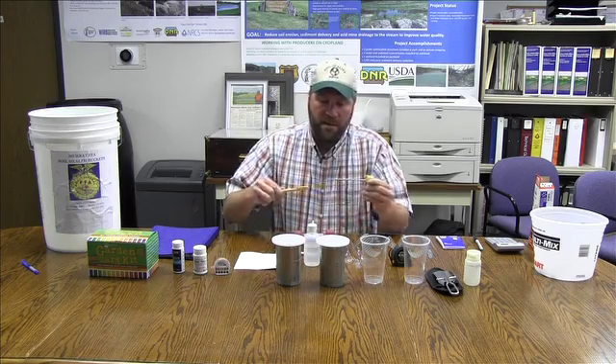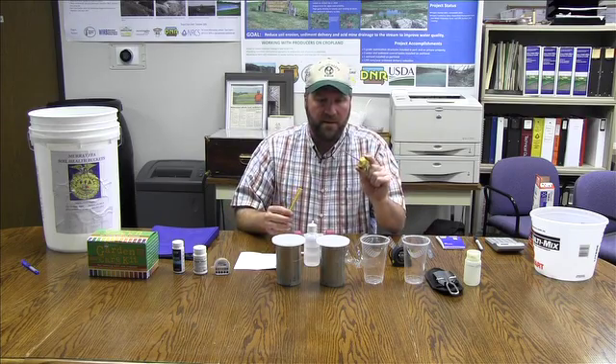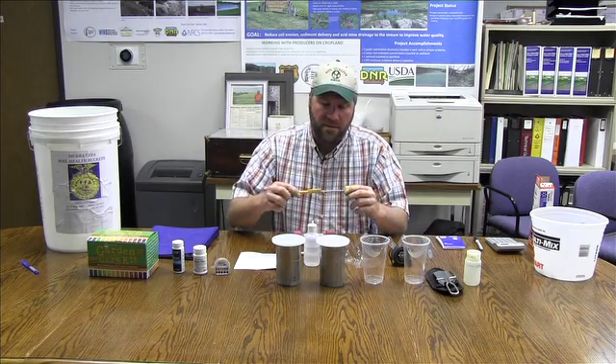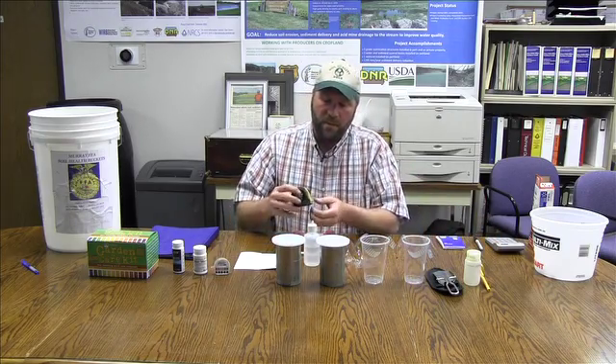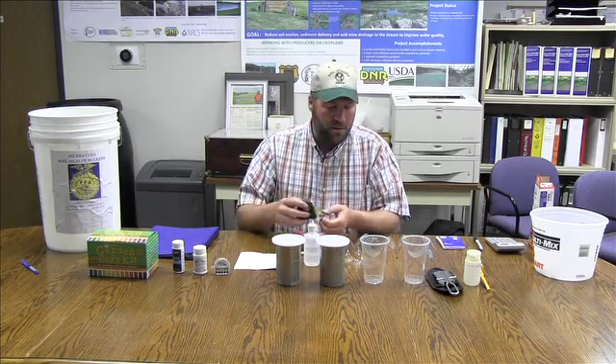There is a thermometer with on and off buttons and a battery. You just take the protective case off and stick that into the soil to a four inch depth to measure the soil temperature. If you are digging with your larger spade and want to get the most accurate depth, there is a tape measure included.